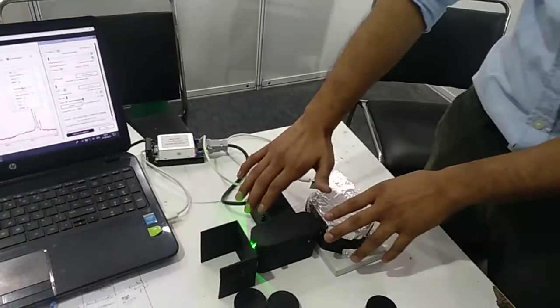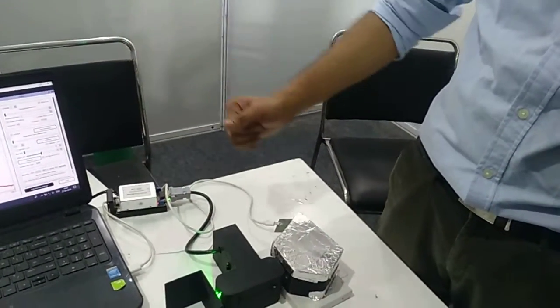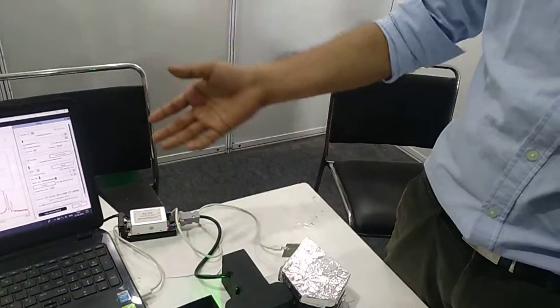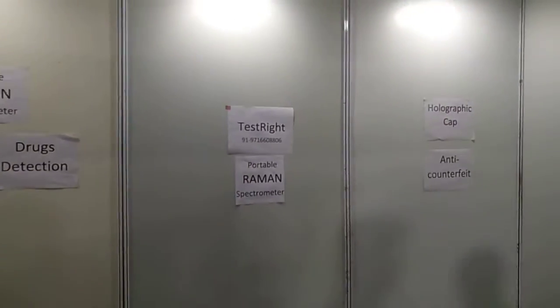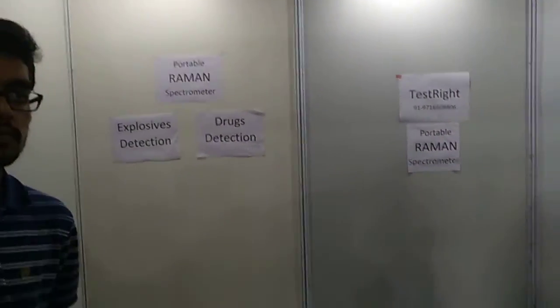It is such a small product compared to the big products that existed before. Previously you had to send your samples to a lab, which took a lot of work and money. Now you can use this device in the field.